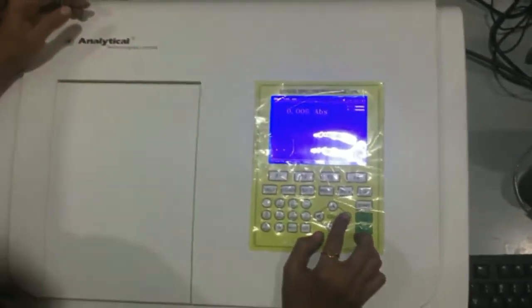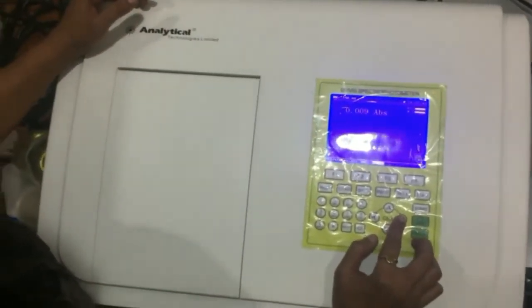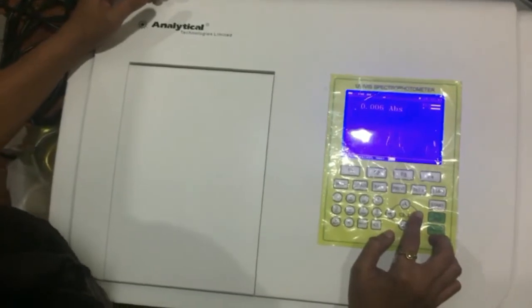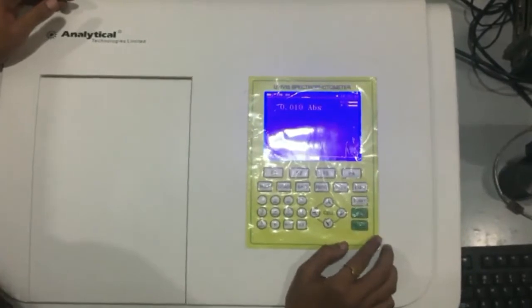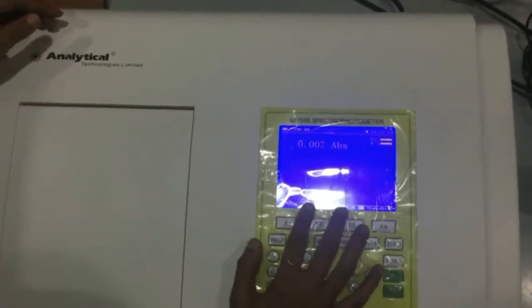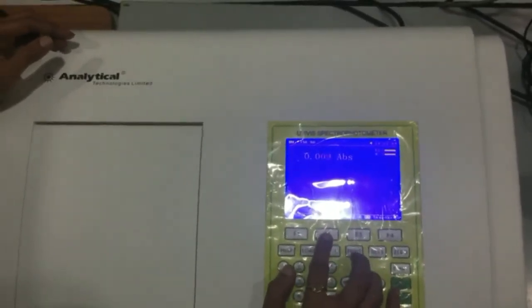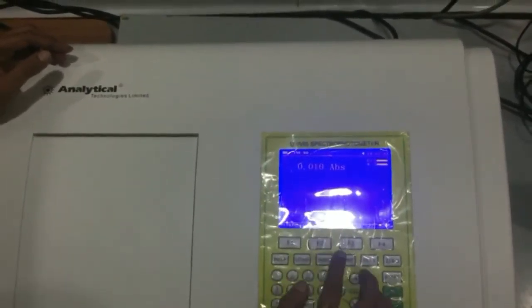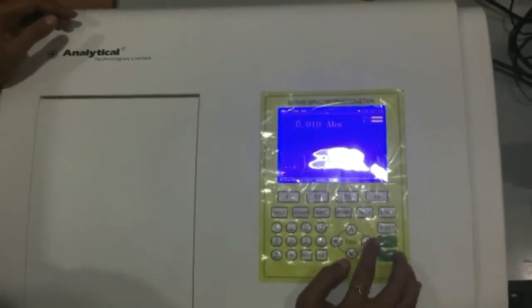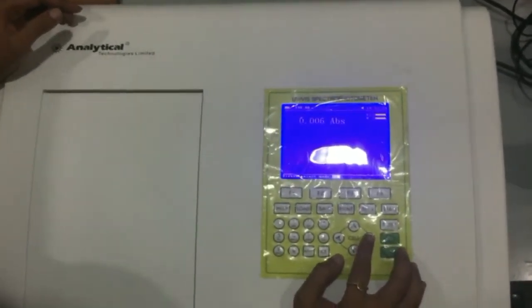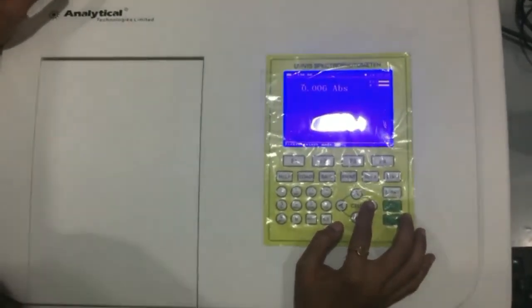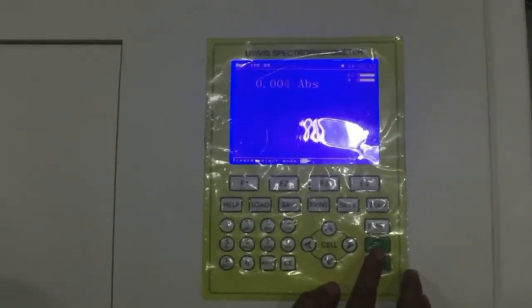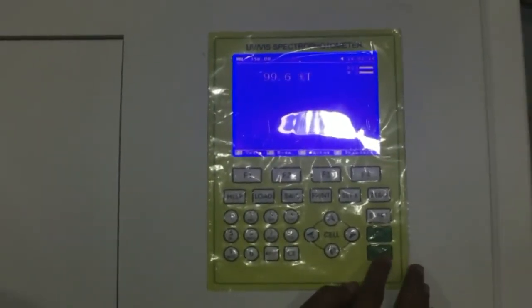Unit options include milligram per liter, milligram per milliliter, microgram per mL, or milliliter per liter. After setting the unit, press select. If you want to change the mode of measurement, press F2, where you can select your result mode — whether absorbance, concentration factor, or transmittance in percentage. After selecting the particular mode, press enter.